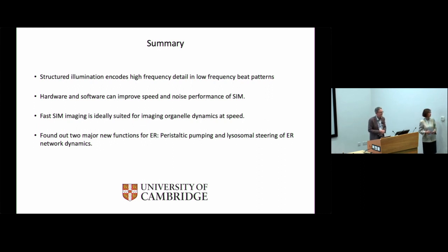There is one more question. To follow up from your question, Maria. If you have these pinching movements, do you see any evidence they proceed in motion, in sequence, or is it just apparently random? No, so between different locations, as far as we can tell, it's random.